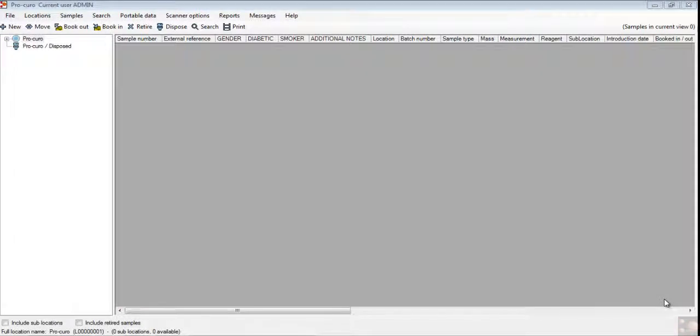Hi, welcome to the initial setup training for your Pro-curo software. In this tutorial we'll go through setting up company details, adding new users, research projects, sample types and disposal reasons.